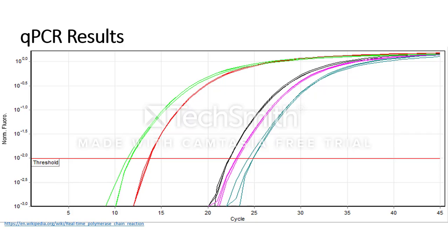In other words, you can be sure of the presence of a specific gene in the sample after the threshold is reached. Verification of the presence of your specific gene can be done without having to run the results through gel electrophoresis. In regular PCR, you have to run the PCR reactions out on a gel in order to confirm the presence or absence of your gene of interest. When fluorescent markers are utilized, the final step of running samples out on a gel can be eliminated.